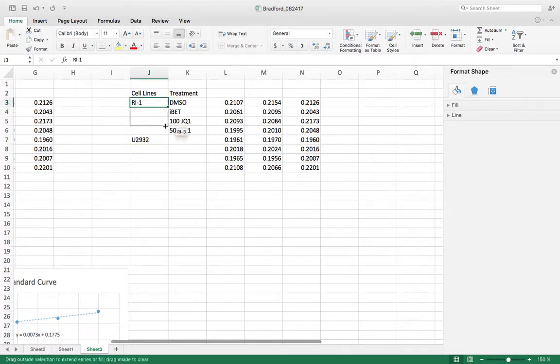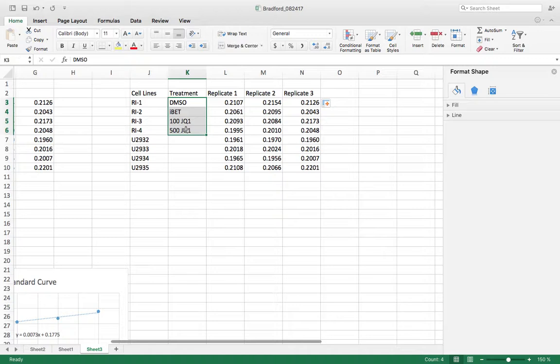So like I said, this is my data, so I'm not doing the exact protocol that you guys will use. For example, I have 3 replicates. You'll only have 2, and I think you'll have fewer samples to do. But what this kind of shows is how convenient Excel can be for doing these.